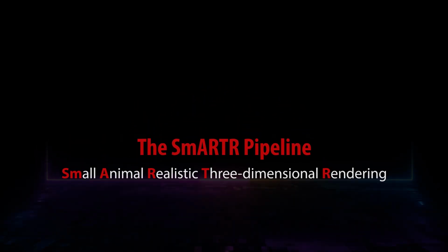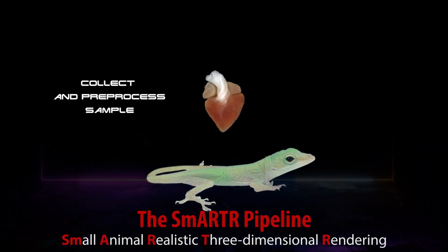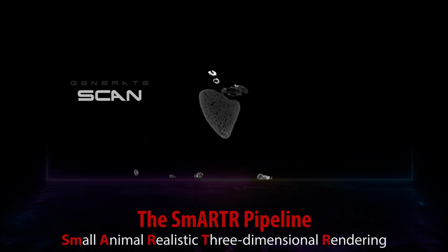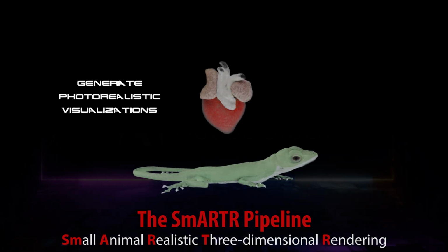This modular, scalable, and versatile workflow integrates wet lab procedures, imaging, and advanced volumetric data processing, enabling the generation of photorealistic 3D cinematic visualizations within a free software environment.